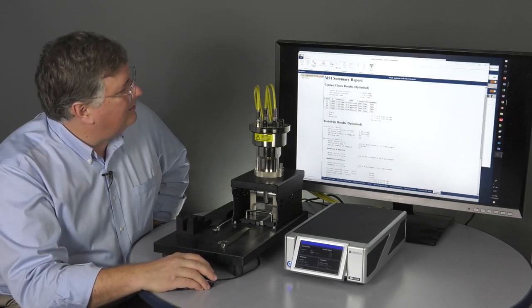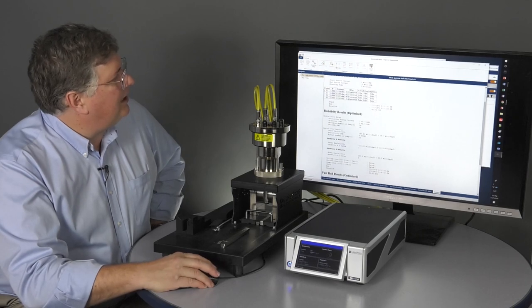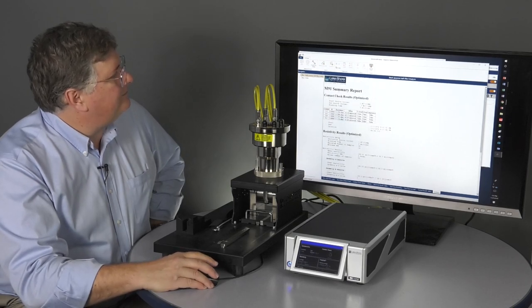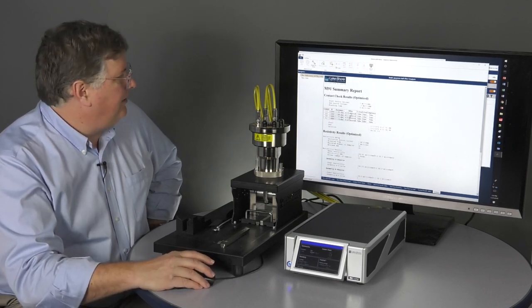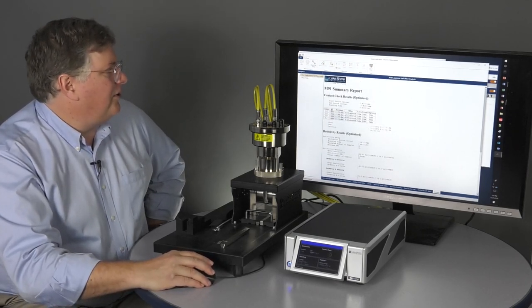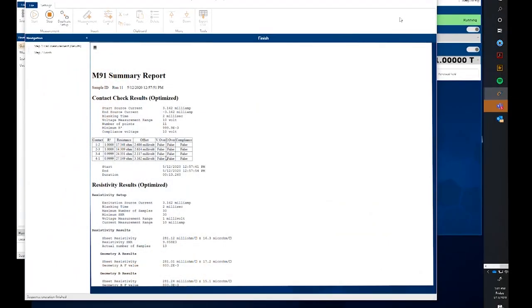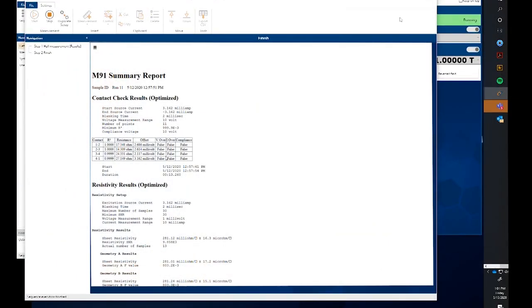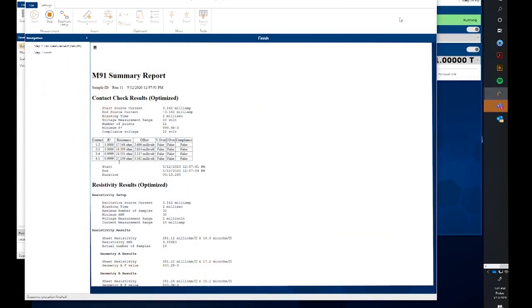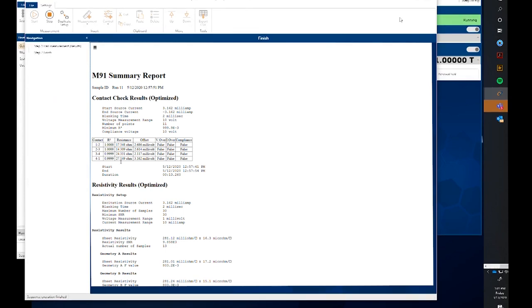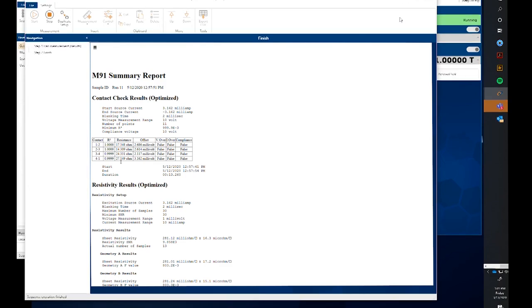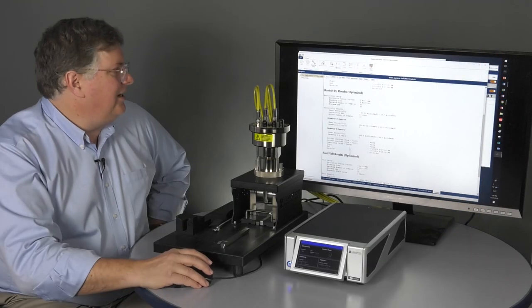So, looking at the sample here. First section on contact check here shows us values for the R squared value. We've put in a minimum of 0.9999 for the linear fit of the IV curves. All of those exceeded that and so they passed.